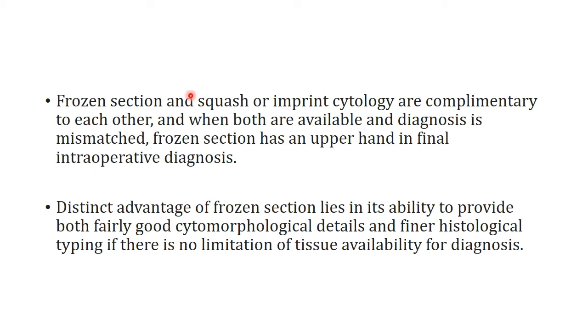Now, frozen sections and squash or imprint cytology are complementary to each other, and when both are available, it must be noted that frozen section takes the upper hand in providing a final intraoperative diagnosis. A distinct advantage of frozen section is the architecture that it provides. So it gives a more cytomorphological architectural diagnosis and hence helps in finer histopathological typing.